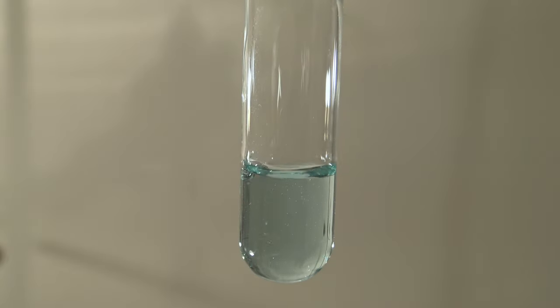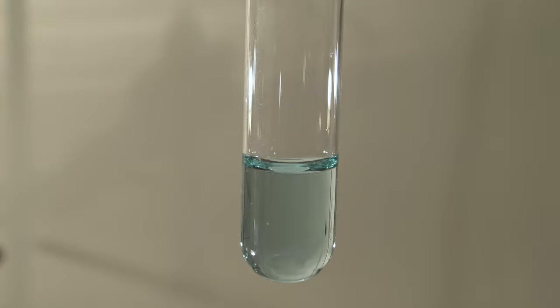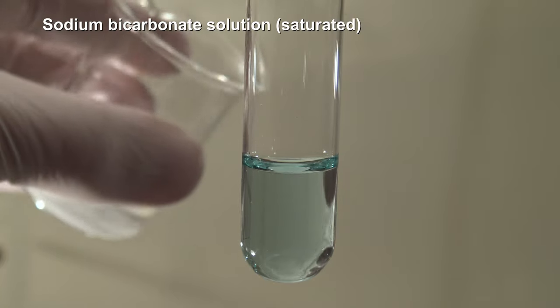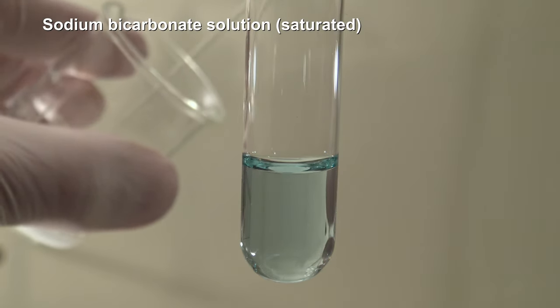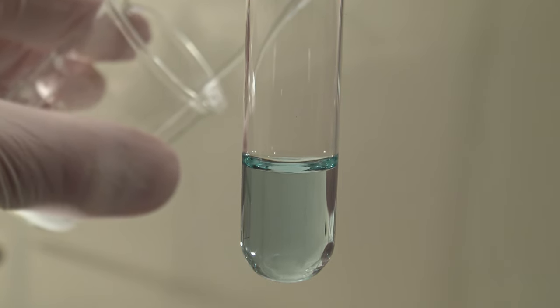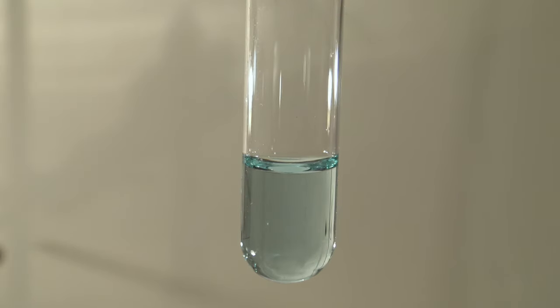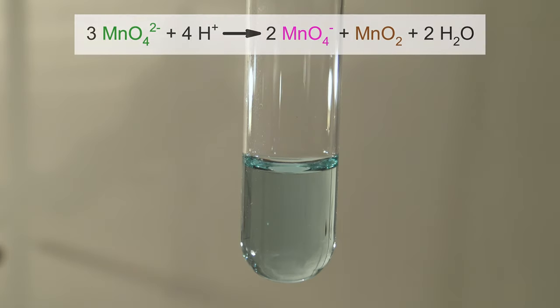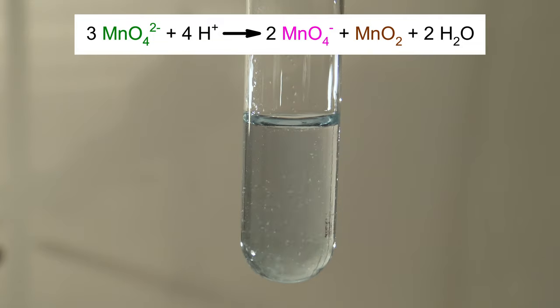To test if this is indeed manganate-6, a saturated solution of sodium bicarbonate was added. Interestingly, the bicarbonate acts as an acid. The acidification of the solution causes the manganate-6 to disproportionate into the permanganate and manganese dioxide.